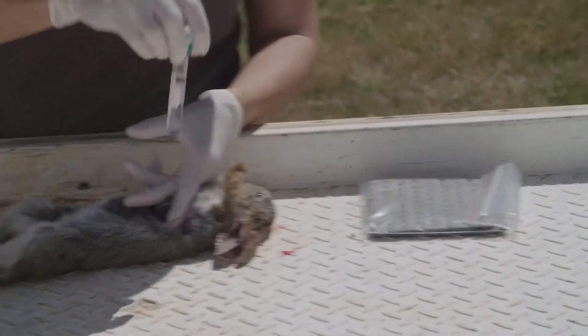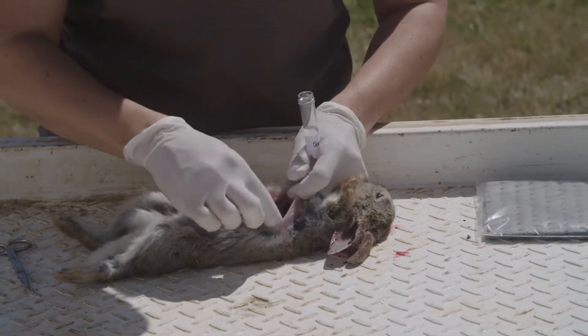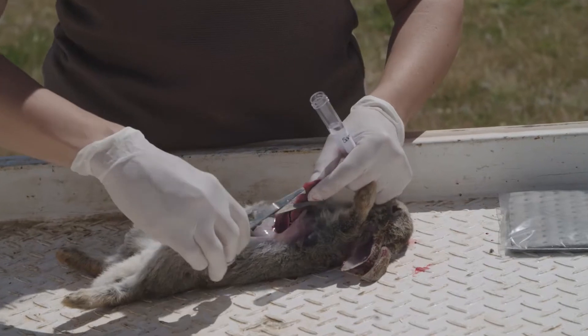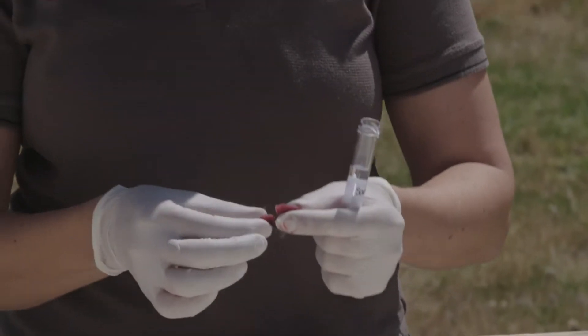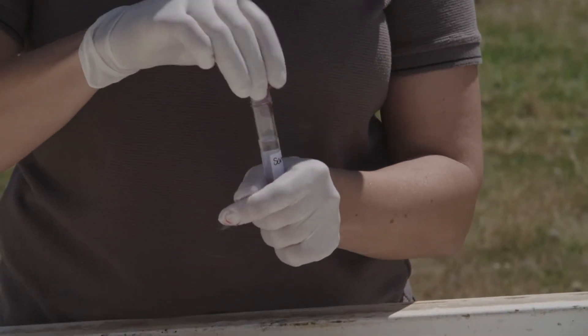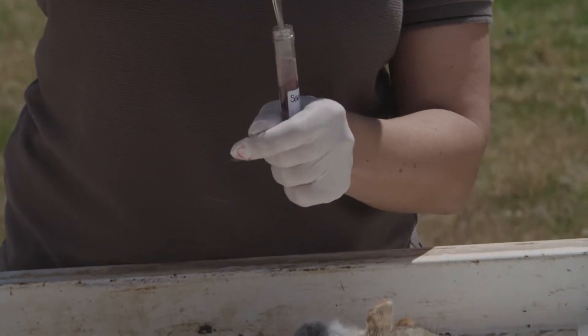Get your tube — if you've got someone to help you it makes it easier. Cut off a piece of liver about that size, put it into the tube, and make sure it's completely submerged.